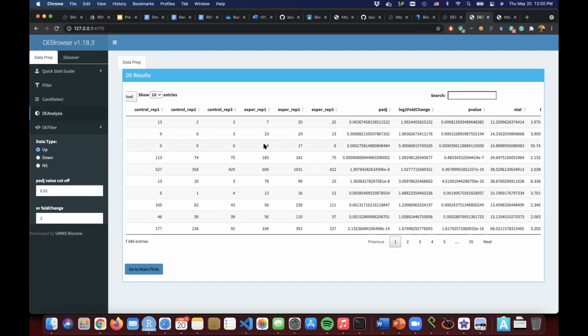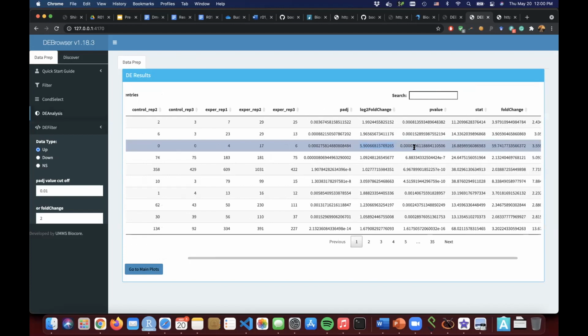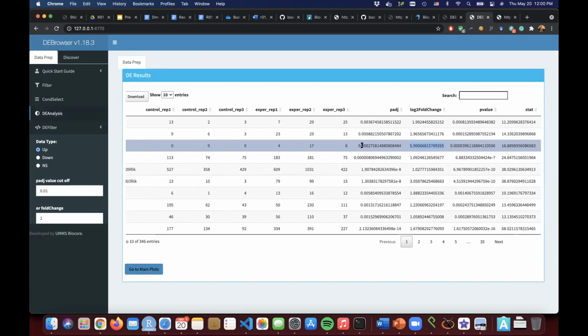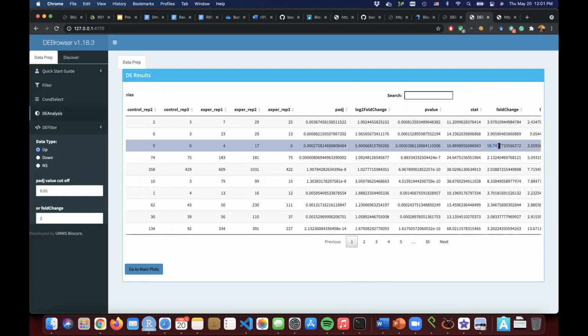So is there some sort of statistical analysis that happens in the background that we are not aware of that changes this 0 to some other value so that we can divide by 0? Well, by the new value. It is changing it, and see, it found a fold change of 50, for example, for this. It just did it by itself.